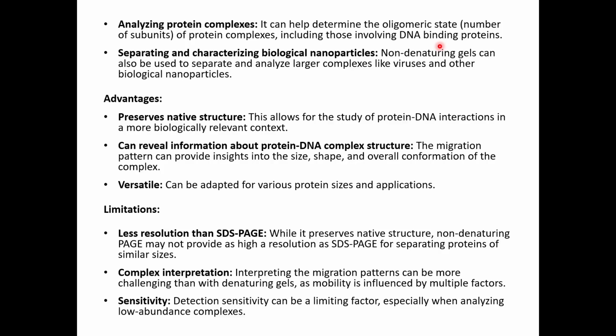Then separating and characterizing biological nanoparticles. Non-denaturing gels can also be used to separate and analyze larger complexes like viruses and other biological nanoparticles, because the gel does not degrade or denature the proteins present in them.